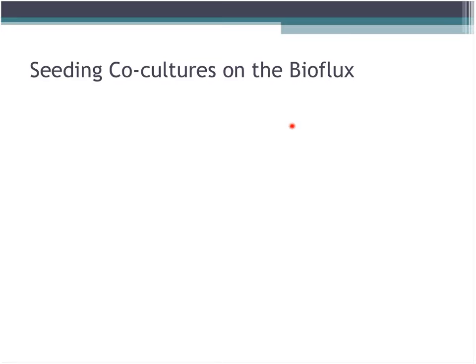Okay, I'll just talk. So when I've been talking to other BioFlux customers, this is one of the main things we end up talking about: how do you get your cells seeded beautifully on the plate so that you can do good experiments. So what I would do, I worked with endothelial cells, HUVEC cells, which I was able to isolate from umbilical cords a couple of times a week, which is one of the advantages of working in an obstetrics department, I guess.